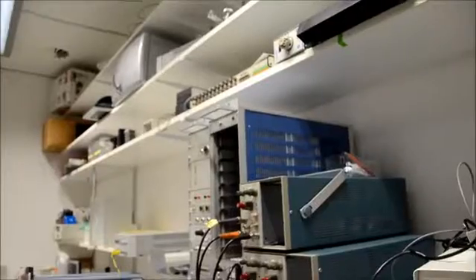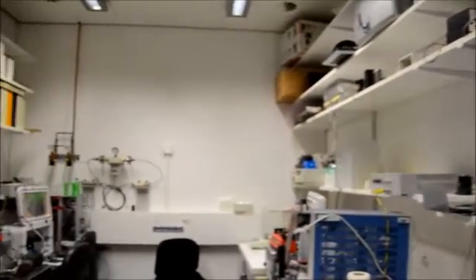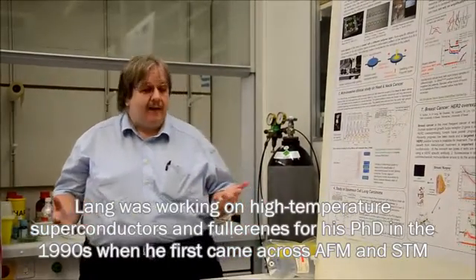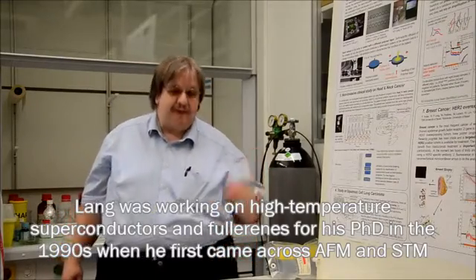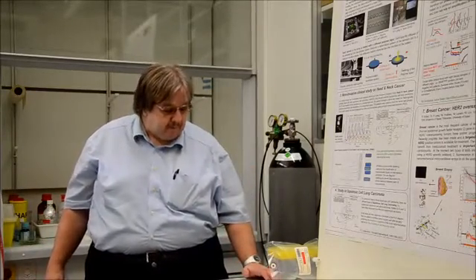I'm a physicist by training and in the early 90s, I did my PhD here at the University of Basel, at this time still on high-TC superconductors and graphite, fullerenes, and these kind of things. At that time I also encountered that fabulous invention of Christoph, the force microscope and the scanning tunneling microscope, and it was really very interesting to apply that to these materials, to the high-TC superconductors and the fullerenes.